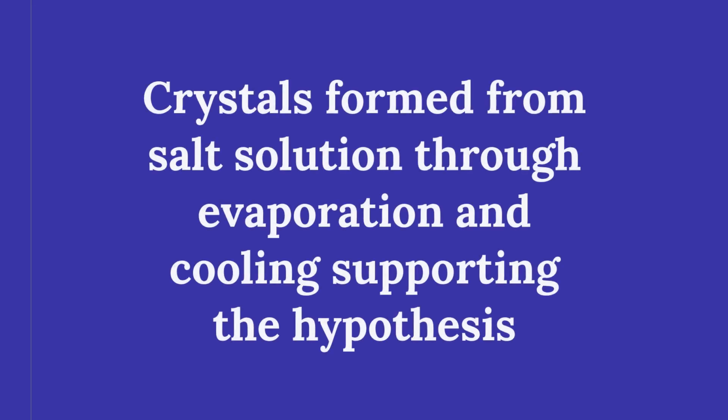The goal was to produce crystals from a salt solution via evaporation and cooling. The hypothesis stated that evaporating water would lead to crystal formation. This occurs as the solution becomes saturated and excess solute crystallizes. The method involved heating the solution and allowing it to cool. Crystals formed as expected, supporting the hypothesis.